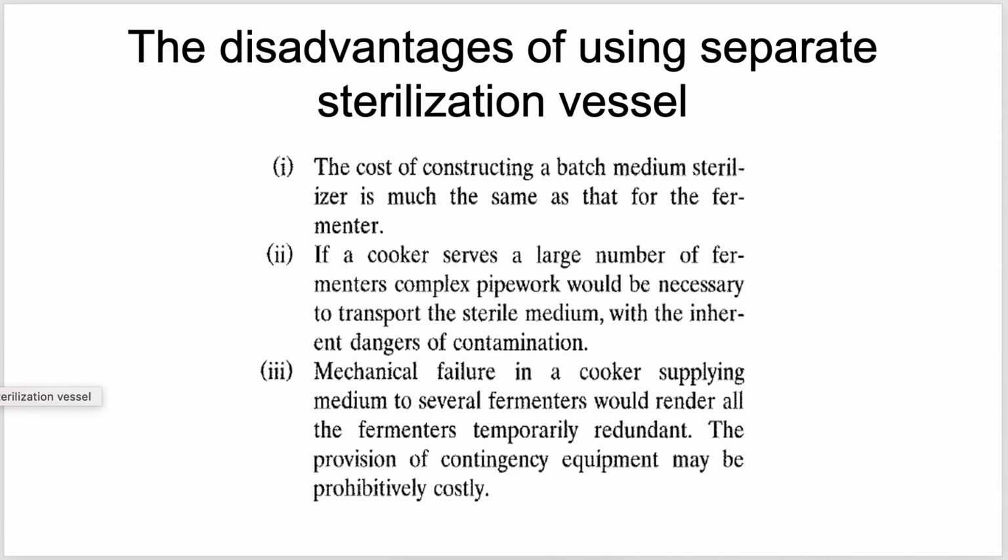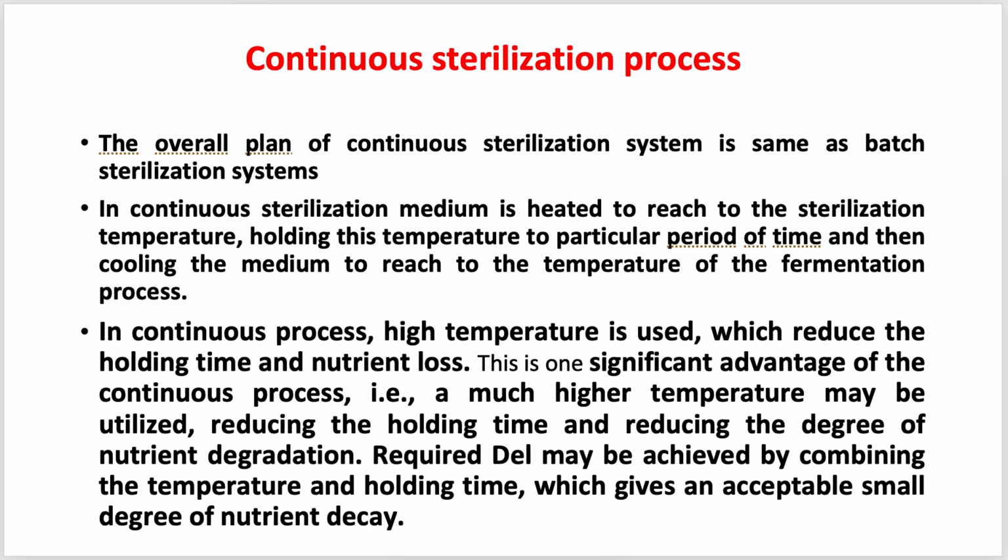That was all about batch sterilization. In the next part, we will learn about the continuous sterilization process.